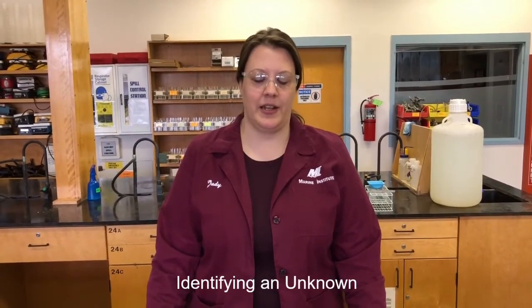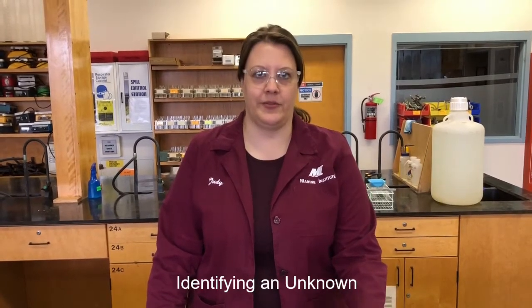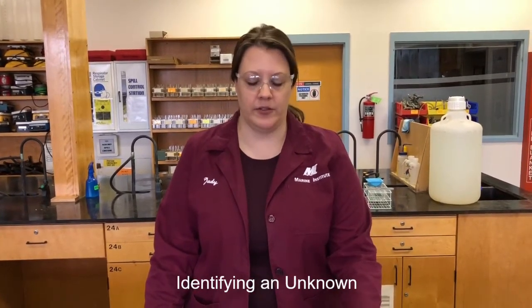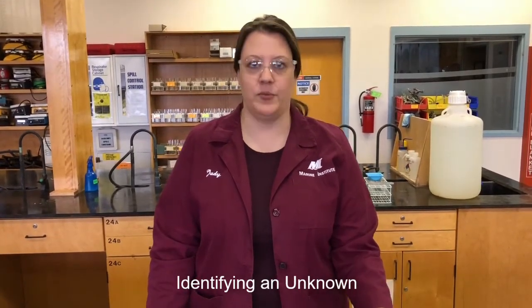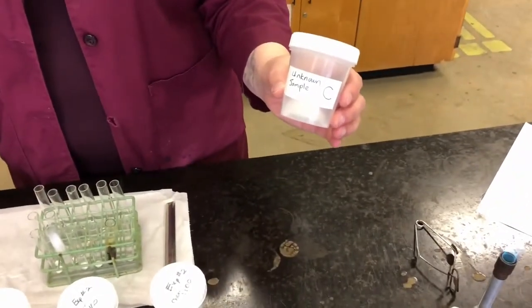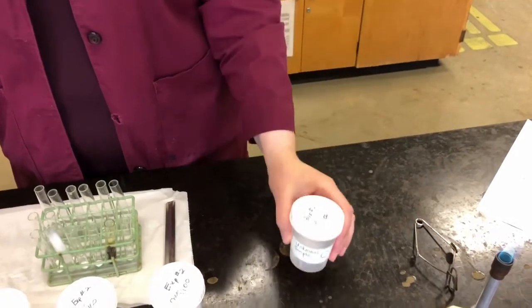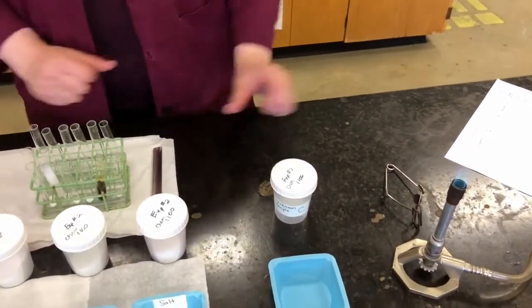So I mentioned in the beginning that part of chemistry is commonly trying to identify a substance that you don't know the identity of. So we've tested 6 substances. I do know that our unknown is one of those 6 substances. So we're going to take our unknown sample. In this case, it's just labeled C. So again, we don't know what it is. So we're going to do all those same tests that we did on the other substances with our unknown substance.